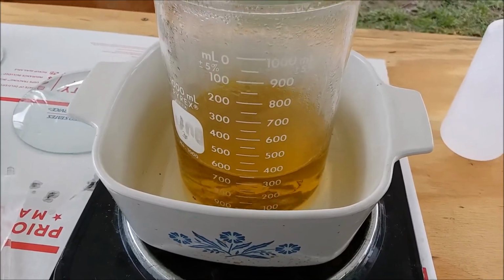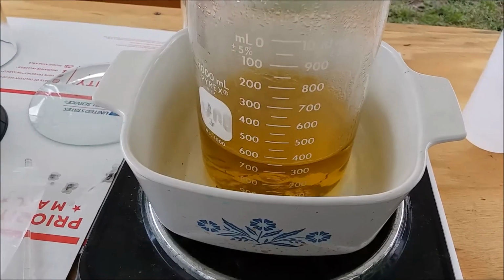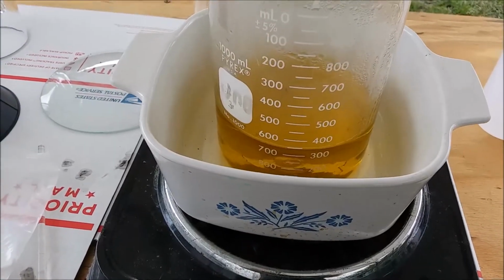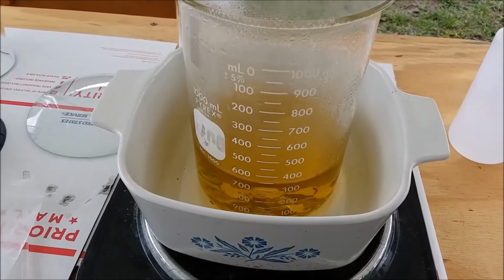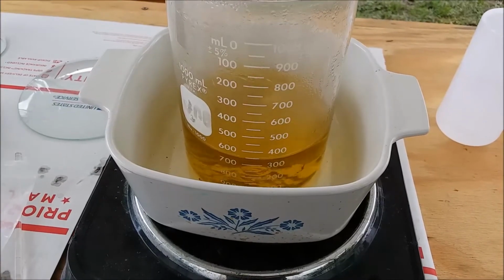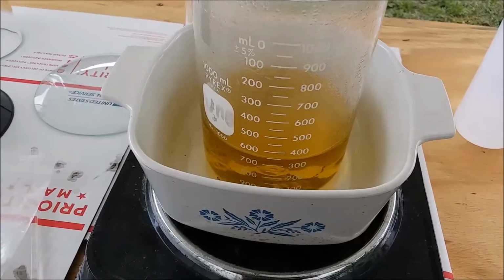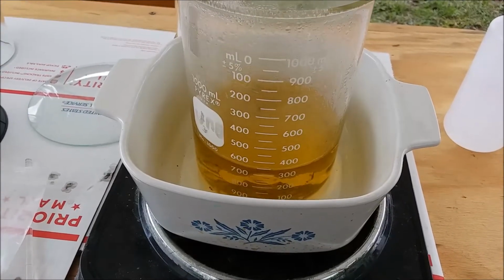Okay, this has been on the heat for a while now. The volume has been reduced to, well, a little over half of what it was. And the chlorine seems to have been pretty much boiled off. So I'm not getting big clouds of chlorine gas coming out of it anymore. So I think it's about time to try dropping the gold. Let me get it off the heat.